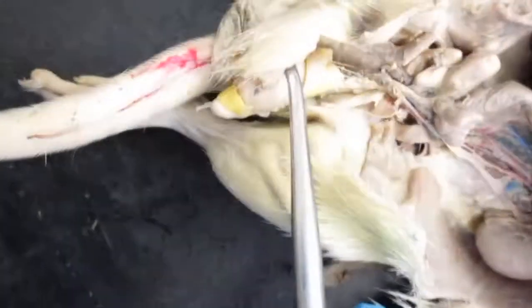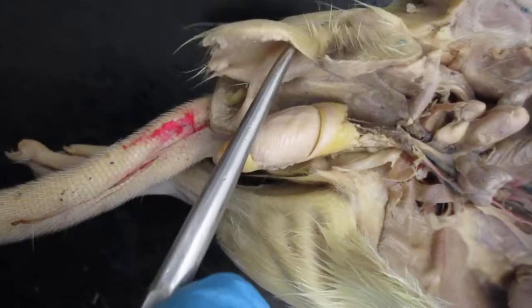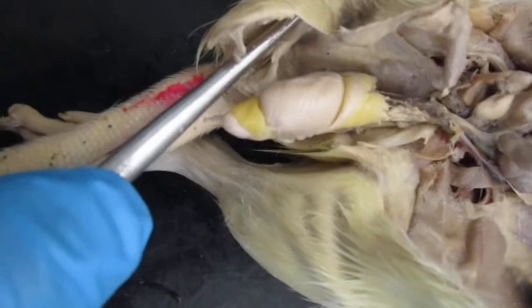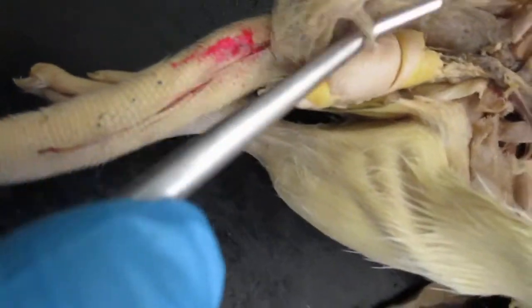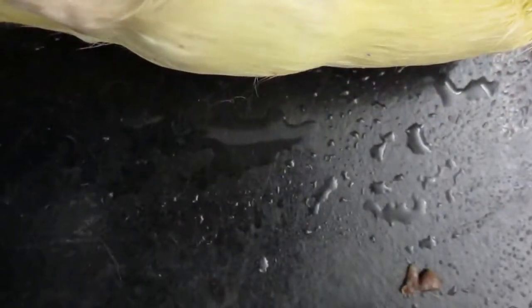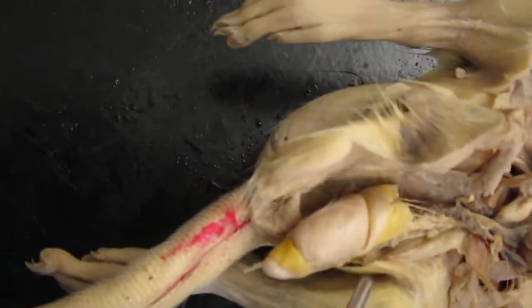Okay, now right here you can see the scrotal sac has been cut open, and you can see the testis and the epididymis. Can you see that? So, testis is this structure right here.